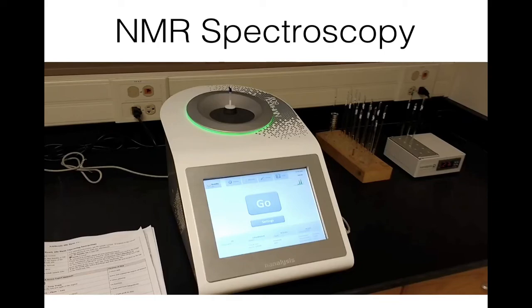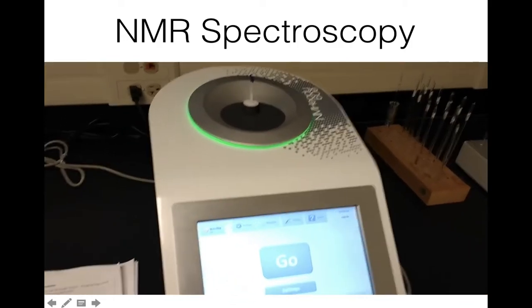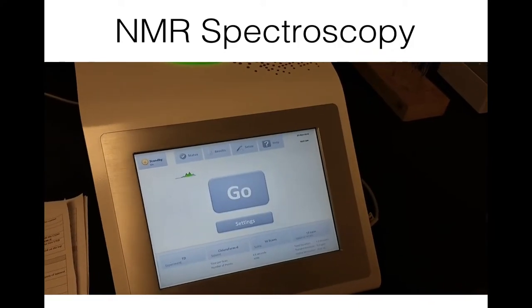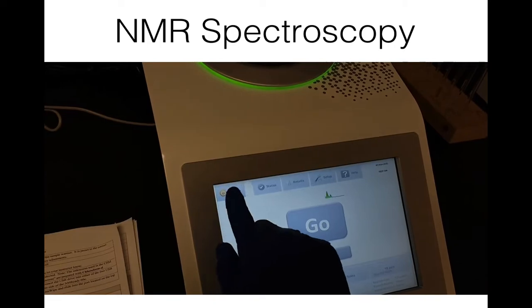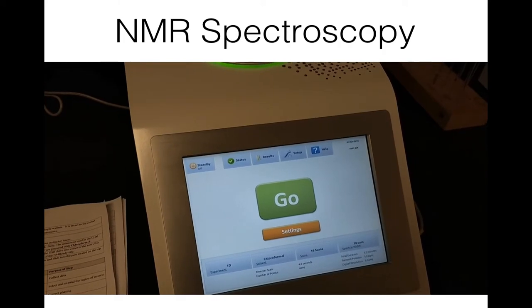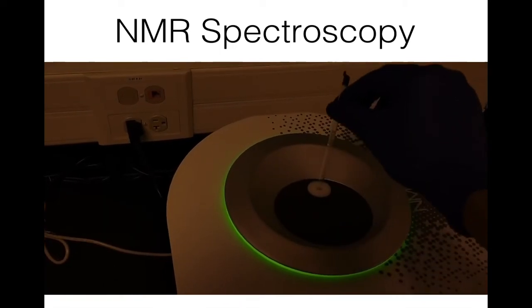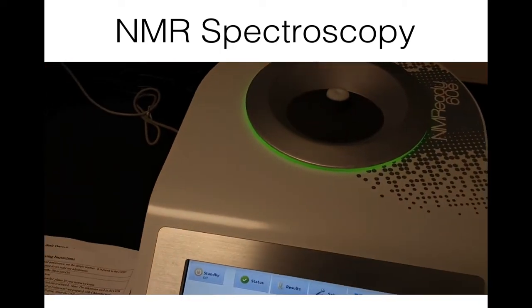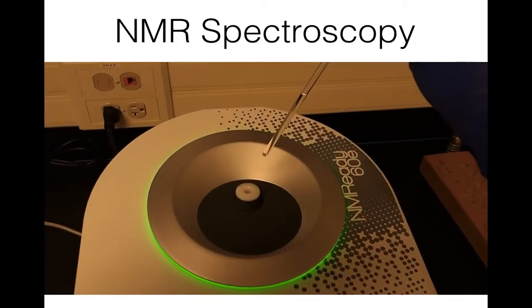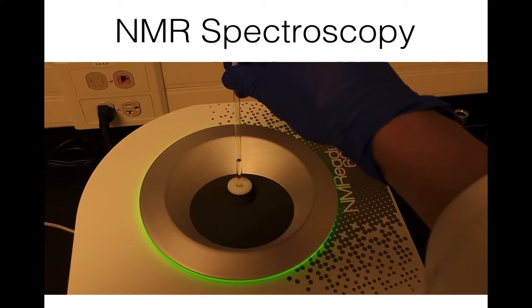This is how to analyze a sample using the NMR in our laboratory. Turn off the standby mode if the instrument is on standby. Remove the sample and replace it with the sample to be analyzed. The sample tube is a long and skinny tube, so be careful when inserting it into the sample holder.